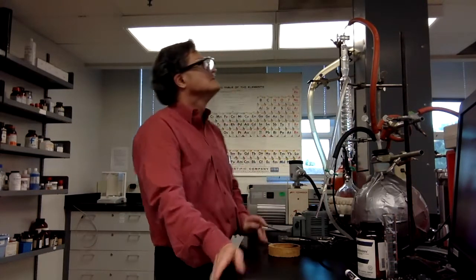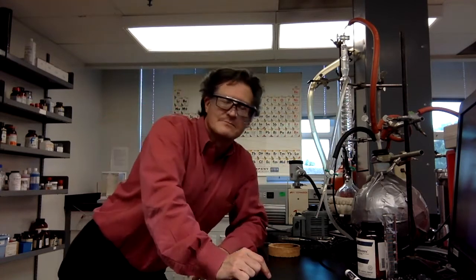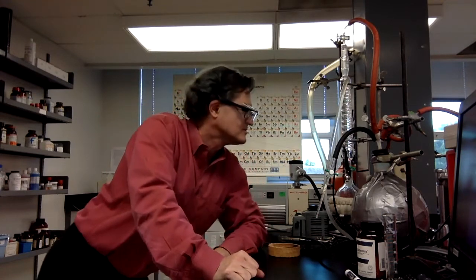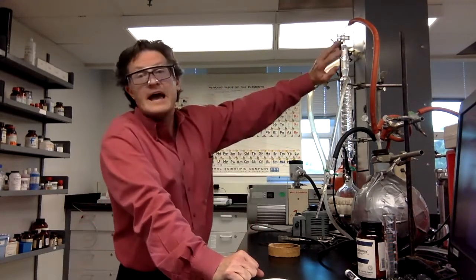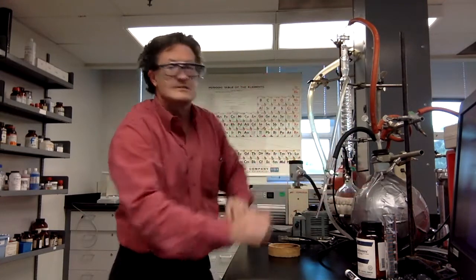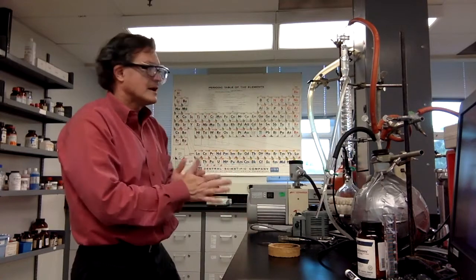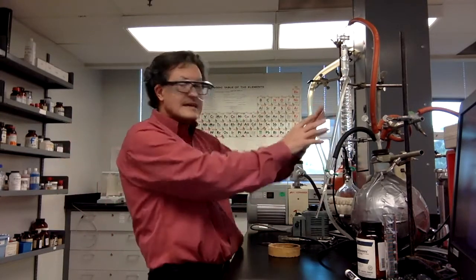Oh, wait a second, I almost did something terrible. Got to be careful. I didn't do something terrible, but I could have. I want you to be aware of this. When you do a distillation, very often you have this open. Right now it is open to the ballast and all of that. That's fine. If it's open to the atmosphere, you don't have any trouble with getting too much pressure in here.